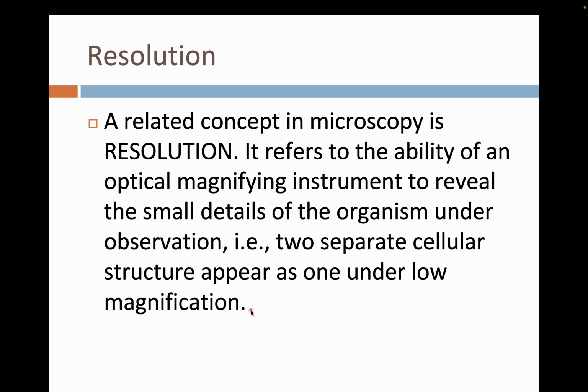Okay? Then another concept relative to our laboratory proper is the concept of resolution. Resolution refers to the ability of an optical magnifying instrument to reveal small details of the organism under observation. Simply put, resolution is the capacity of your microscope to tell that cellular structures are separate, given a specific magnification.